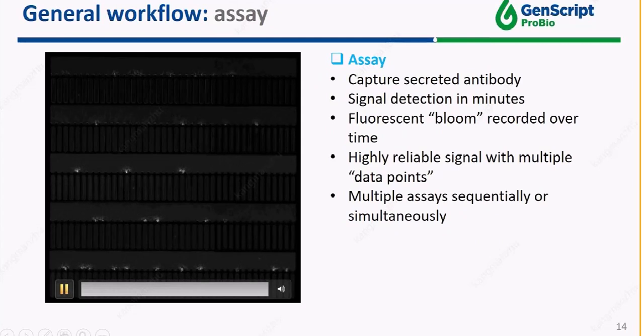Okay, so for the assay, in the video right here, the secreted antibody from each pen is being captured at the opening of each pen using antigen-conjugated beads.